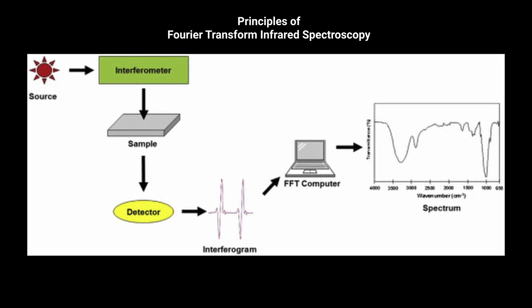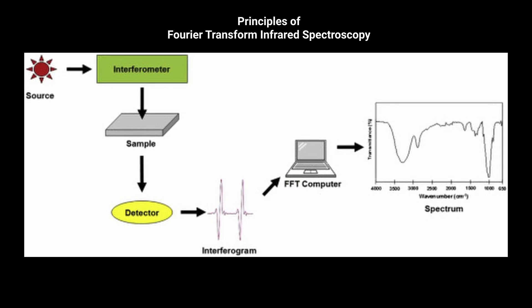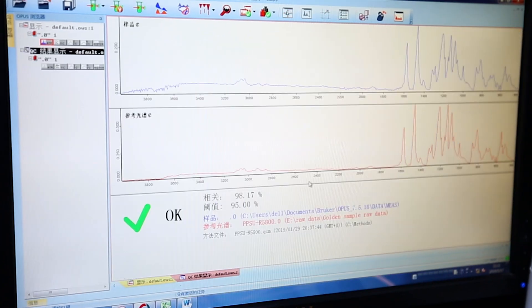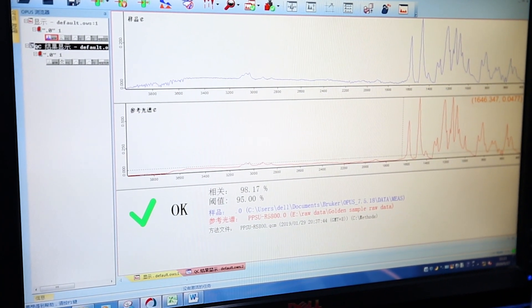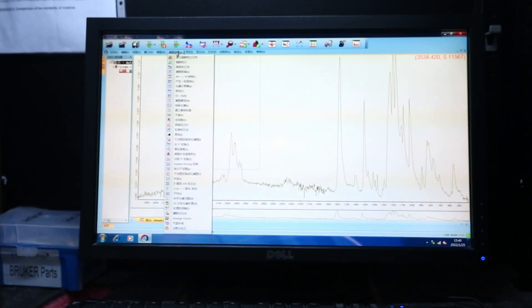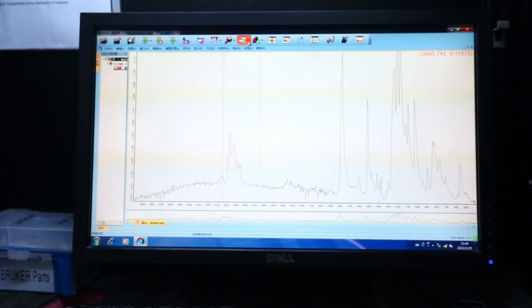The instrument puts out infrared radiation and analyzes the resulting wavelength patterns. The beauty of the Alpha is that it transmits in many frequencies and does so very quickly. This means it can check all of the spectral data at once, rather than one frequency at a time, which was common in the past.